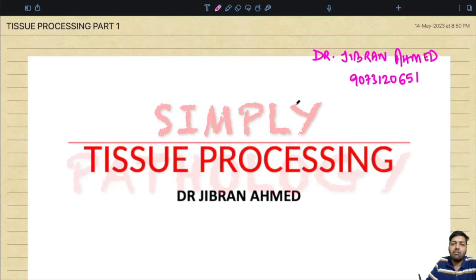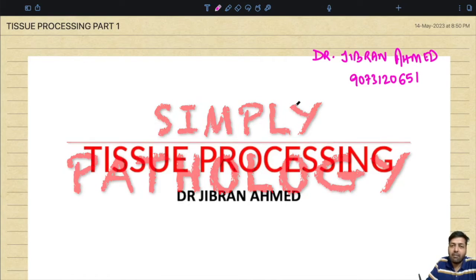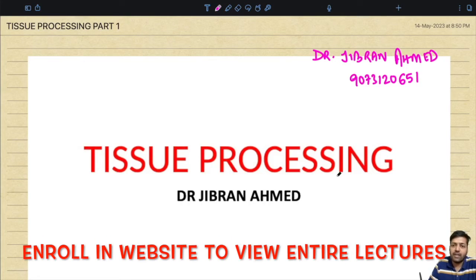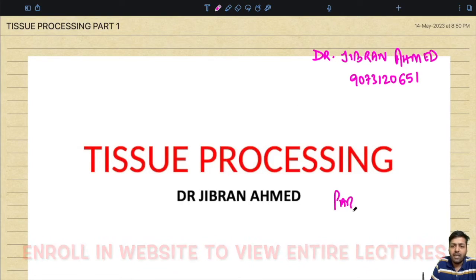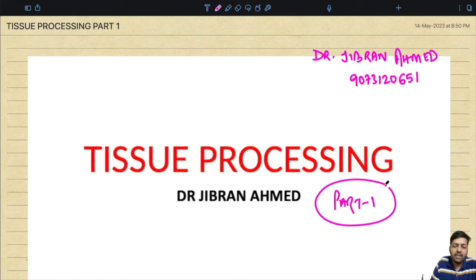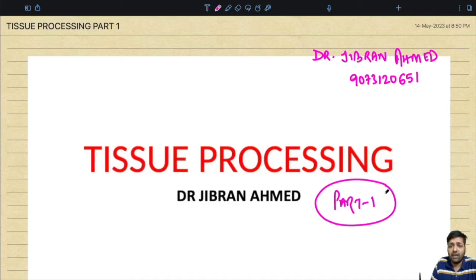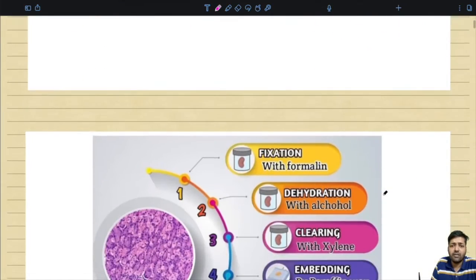Myself, Dr. Jibran Ahmed, presents to you Simply Pathology, and today we are back with a very important lecture. Today we are going to read about tissue processing part 1. In today's lecture we will read about the steps of dehydration, then the process of clearing, and in the end we will understand infiltration and tissue embedding. So let us just revise.